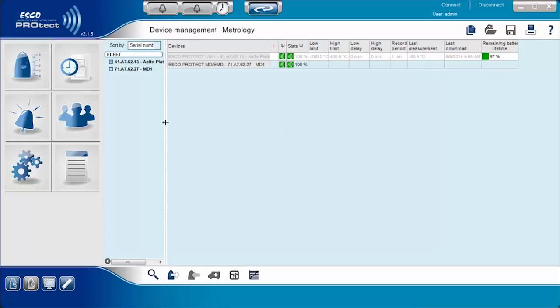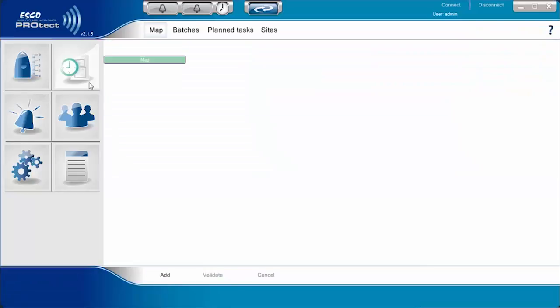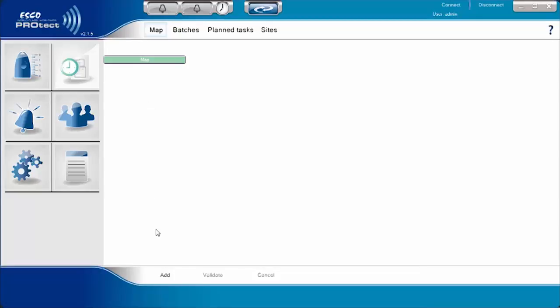The ESCO PROtect software has two modes to manage and monitor the devices connected on the system. The Map Mode lets you view the plans and monitor the units. The Dashboard Mode lets you create several pages to organize the monitored units depending on their location.